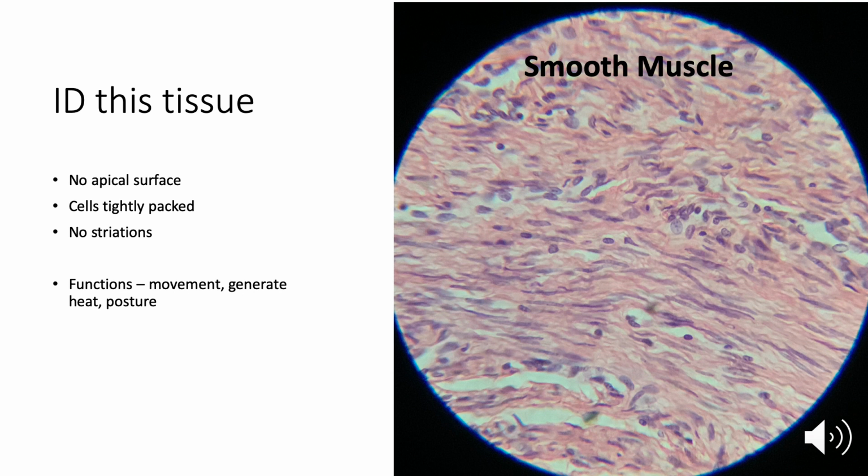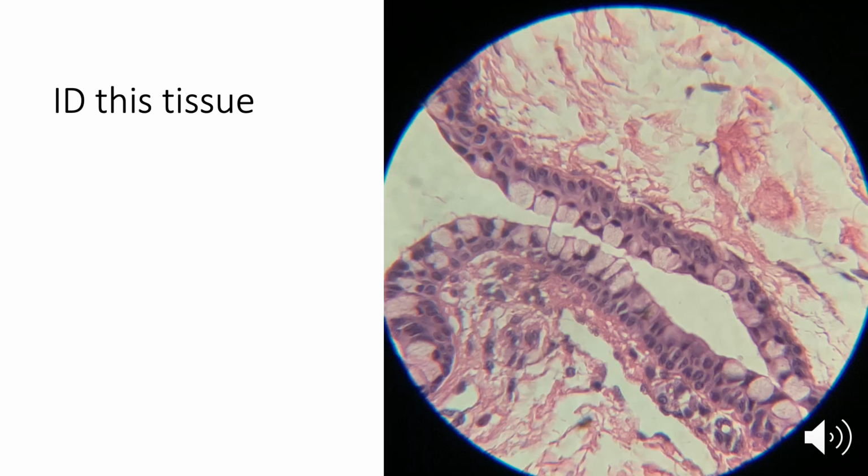All right, we've got some more. Let's keep moving. Here's our next tissue, and on the exam, I would be pointing you to this area on the slide with our pointer. So I see that this tissue comes up right against this empty or white space. So that is going to be my apical surface of cells. Now I want to determine, since I know it's now epithelium, how many layers of cells do I have?